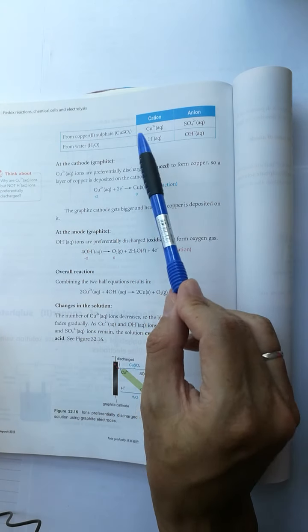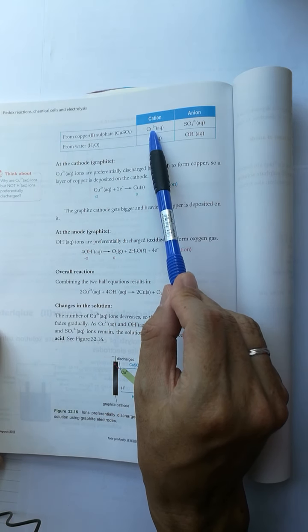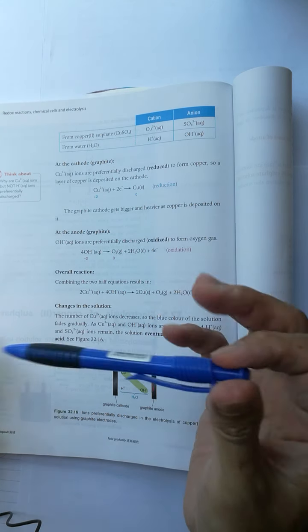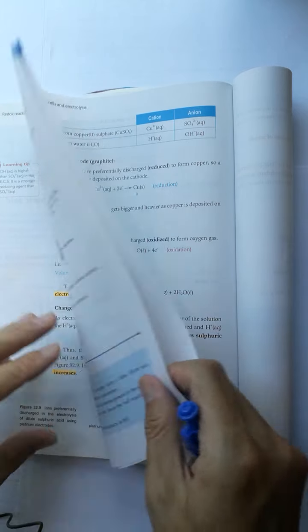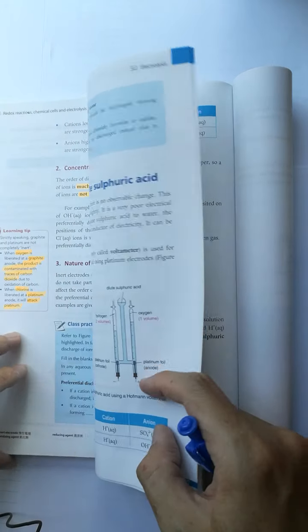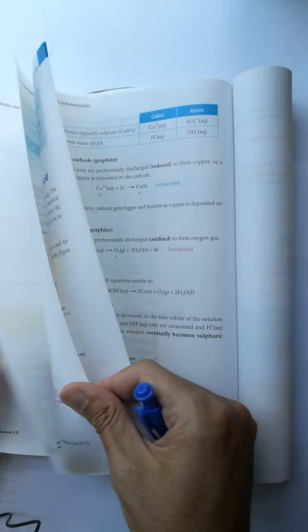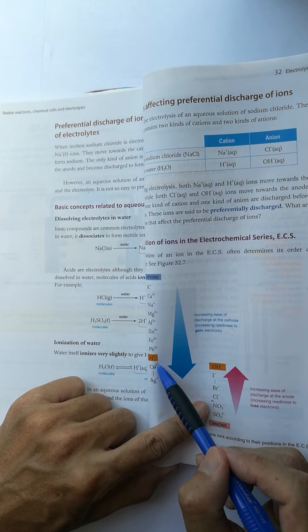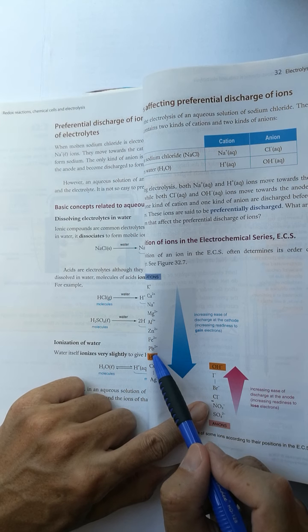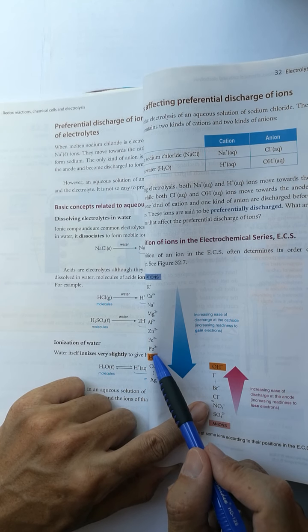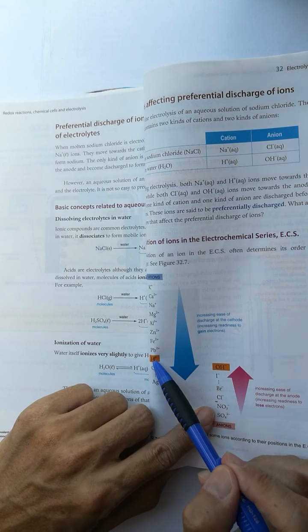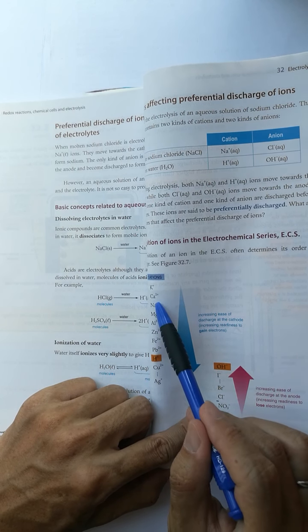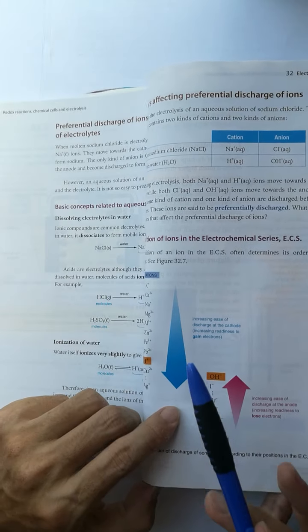The position of the copper(II) ion is lower than hydrogen ion according to the electrochemical series, so it is different from sodium ion.